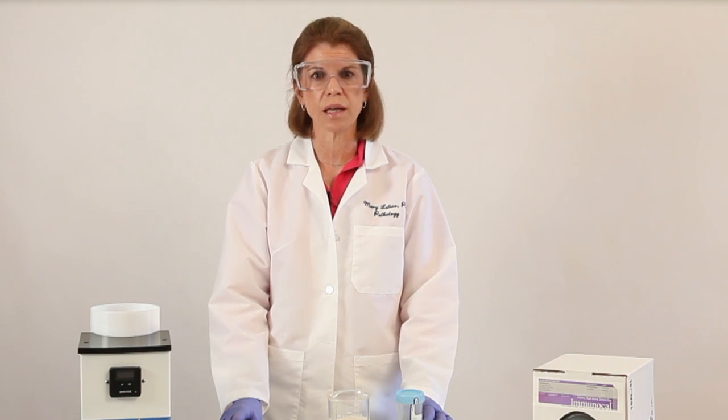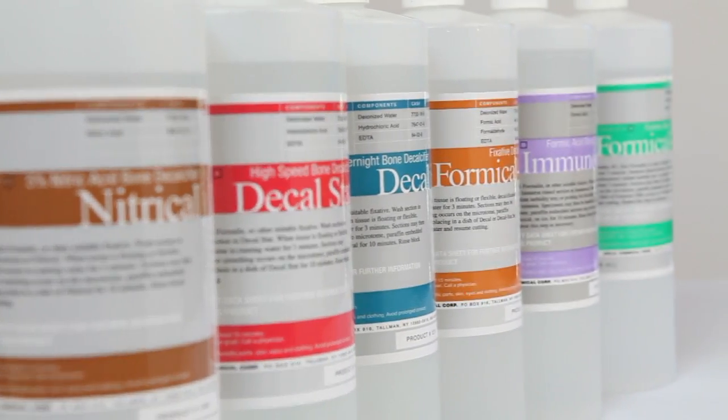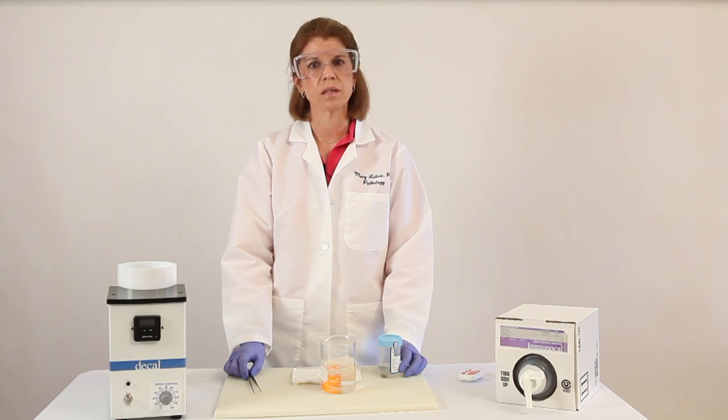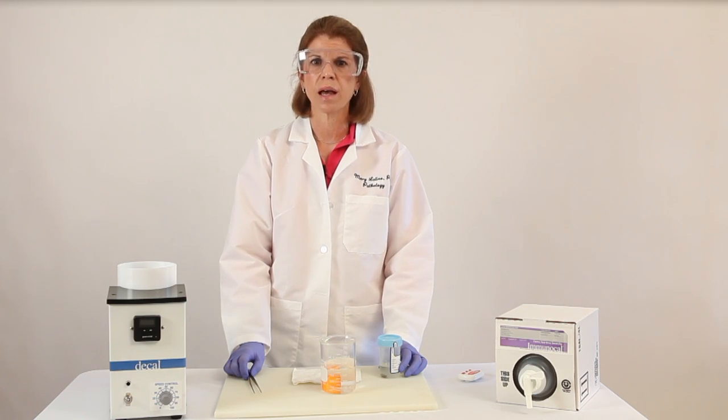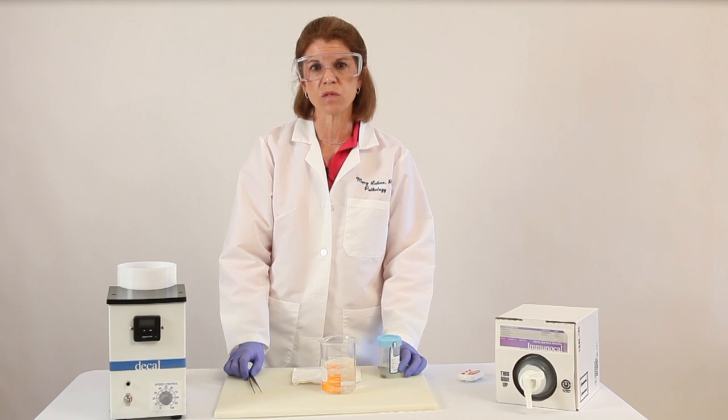Our lab stocks three different decalcification solutions from Decal, so we can always choose the right one based on the type of tissue or bone to be sectioned, type of staining to be performed, and how quickly it needs to be done. You may need to experiment with different decalcification products to determine what's best for your laboratory. Your staining and processing procedures are specific for your lab, and your decalcification methods should be as well.